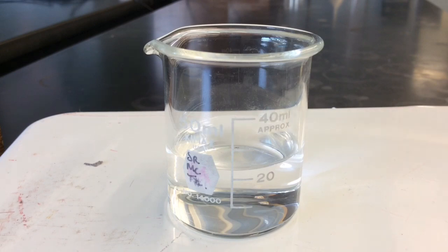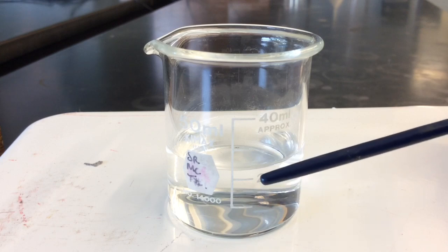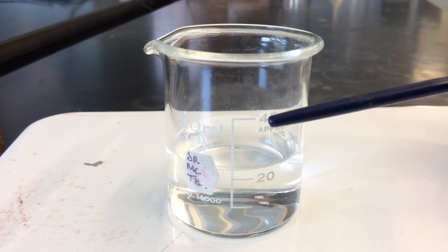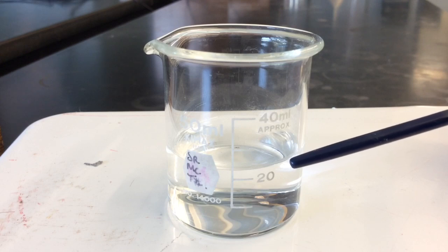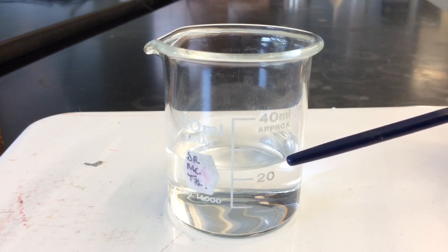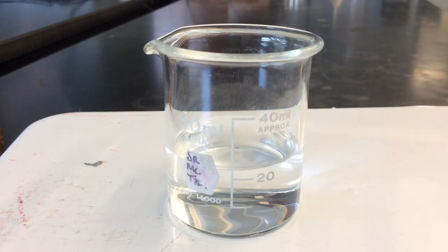The beaker has markings every 10 milliliters. There are marks at 10, 20, 30, and 40 milliliters, and the entire beaker will hold up to 50 milliliters of liquid. When trying to use the graduation markings to measure the volume of a liquid, always measure from the bottom of the meniscus, or at the bottom of the curved liquid surface.